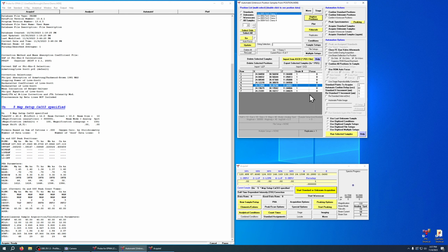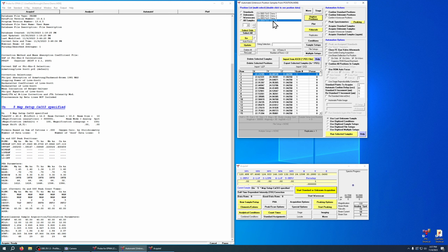Okay, so there's one other feature I want to show you on how to use confirm, or some tricks you can do with confirm, and that is imaging. You can automate imaging by using the confirm. So let's say I've got this sample, and all it is I've gone around and I've picked areas that I want to take images of, but I want to automate those. I don't want to sit here and wait 30 seconds for each image to go while I do it. So I pre-picked all my areas, and I have a list of areas that I want to image.